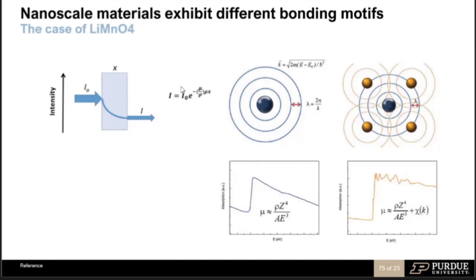And man, God love the physicists that came up with this. When I'm looking at this pattern here, this spectrum here, I'm not taking the time to figure out what happened up here. Maybe I'm not that much of a detail-oriented person. But in theory, when you're modeling this, they really show that these squiggles are reminiscent of interference patterns that happen because the X rays or electrons that are emitted, whatever is being emitted, interfere.